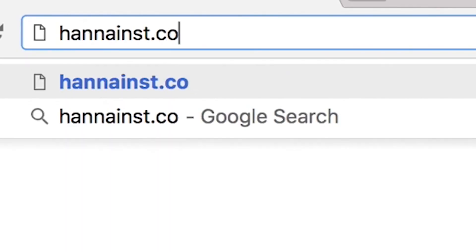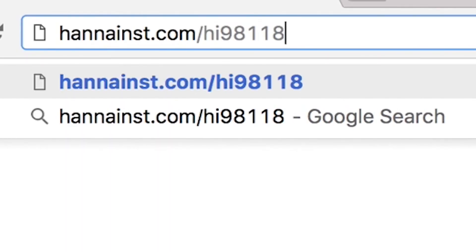So that's it! The HI-98118 pH and temperature tester is a simple to use tool for growers who need accurate pH measurements in their nutrient solutions. Remember to always rinse your tester before and after each calibration and sample measurement. You can find everything you need for your tester at hannainst.com/HI98118.